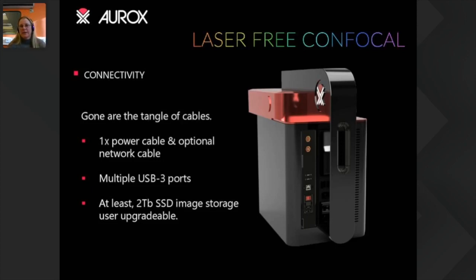Oh yes, and Lee has just reminded me that there are 2 connections at the back, which are prepared for you to put your lab CO2 connection in. So I think somebody mentioned environmental control. That is coming very soon. We're just finalizing preparations for that, and hopefully we'll have some news about that later this year once the COVID-19 crisis allows us to do a bit more work.